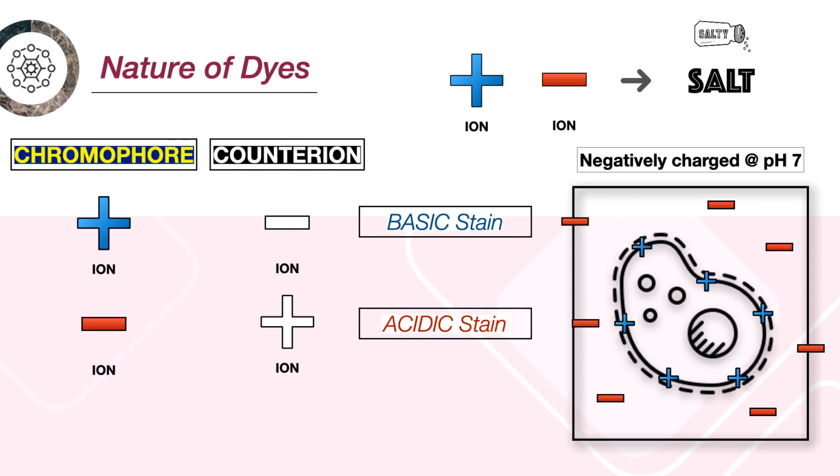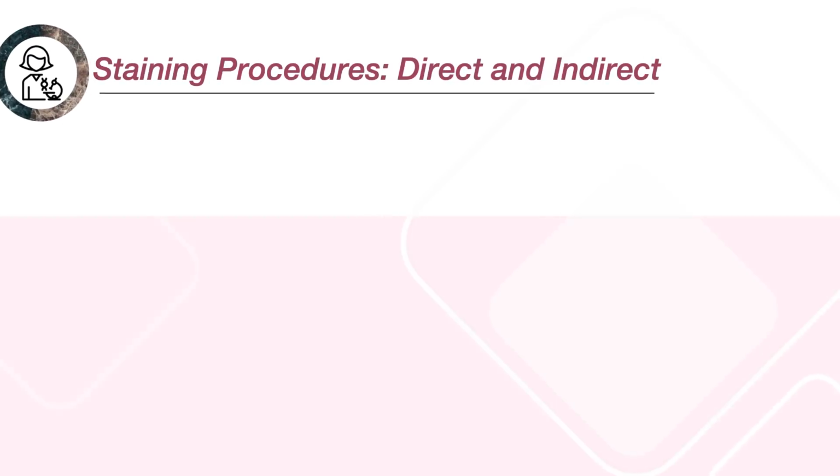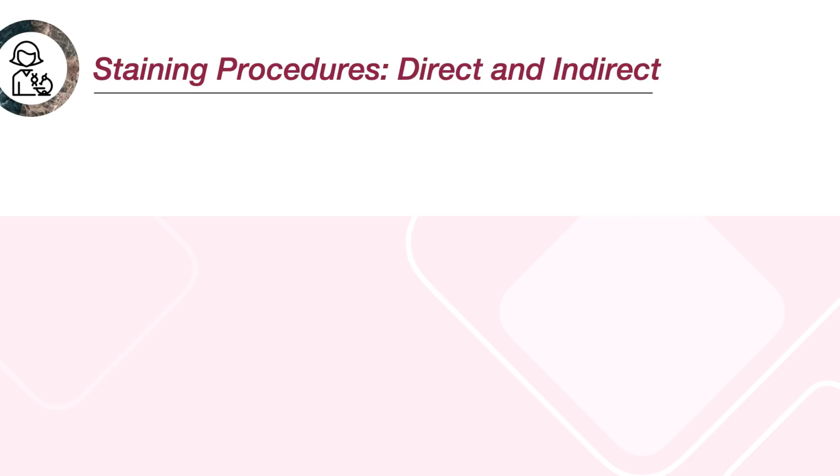Okay. Now that we're done with the nature of dyes, let's move on to the staining procedures. Alright. Your staining procedures come in two forms. Again, highlight ko lang, ha? The determination of the shape, the sizes, the arrangement of the bacteria, and even the structures that they contain, they are all useful in the initial steps in identifying an organism. And much more so, okay, their function is further enhanced by identifying the staining capability or the staining characteristic of a certain bacteria or their structures.